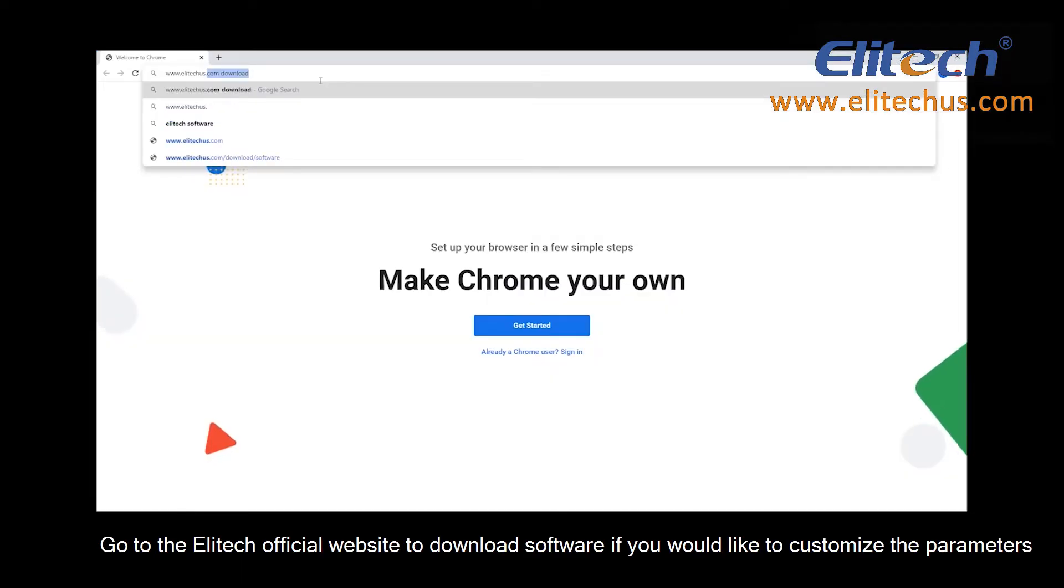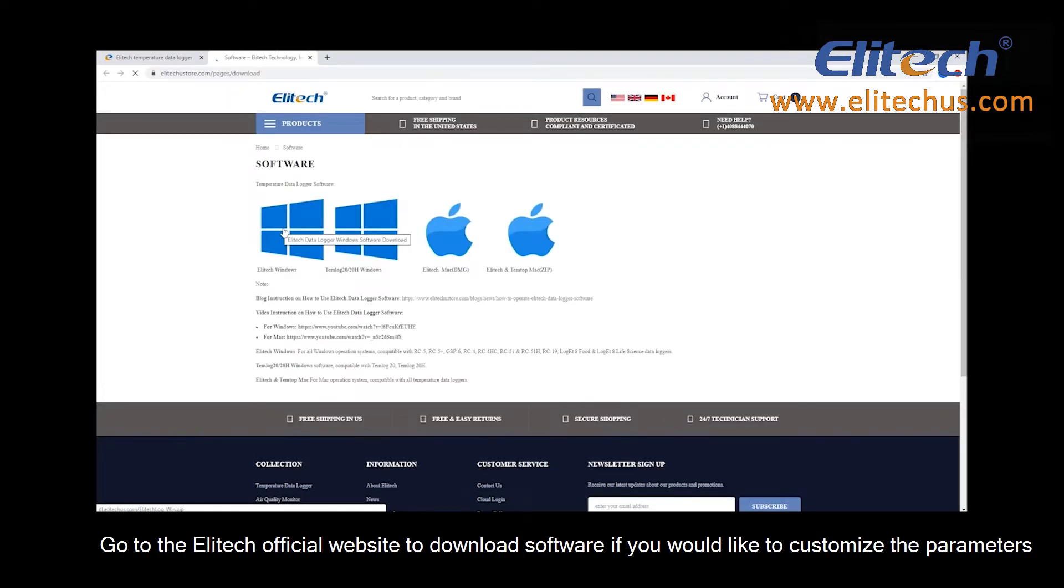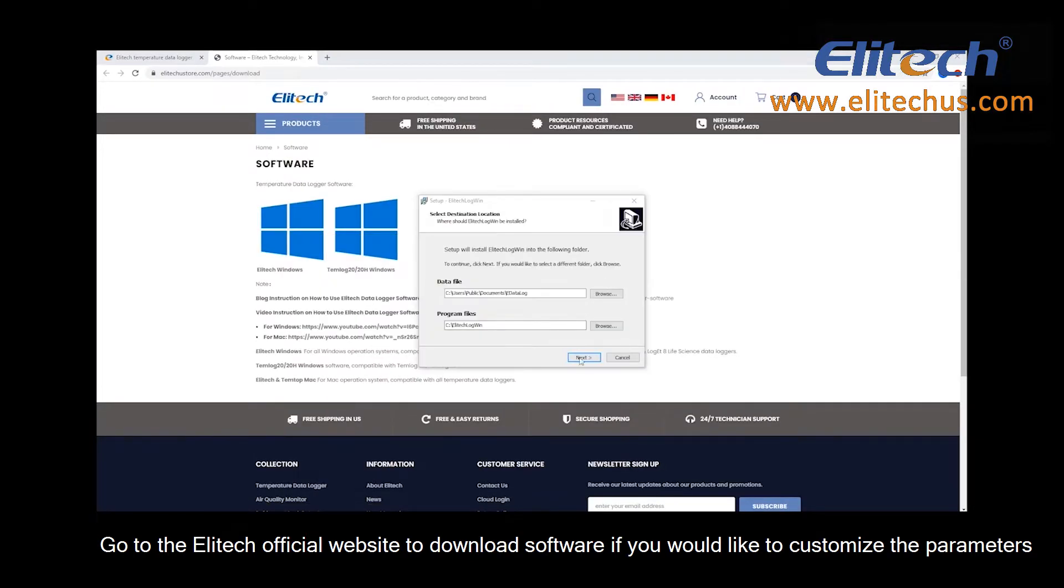Go to the Elitech official website to download software if you would like to customize the parameters.